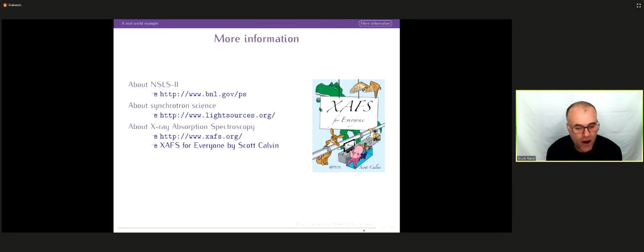Okay, final question. Sometimes it is difficult to fabricate suspected impurities in pure form, or intermediates formed during a chemical reaction, so that you can measure them and do the fitting with the data. Can you calculate XANES either from a CIF file, which is a kind of thing that encodes crystal structures, if crystalline, or any available chemical information, and do the fitting using the calculated XANES?